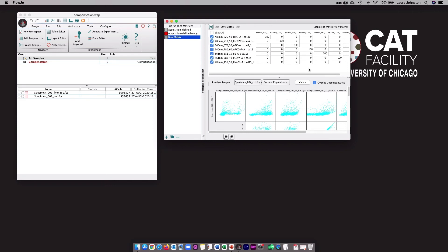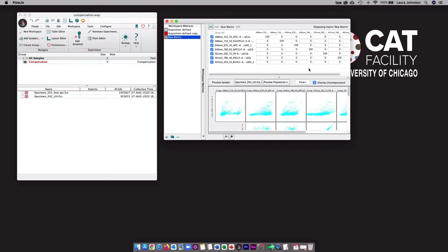The final thing I want to talk about is saving and exporting. Whatever was modified in FlowJo itself only exists in the FlowJo workspace. That means that if you open the original FCS files somewhere else, they are still going to have the original acquisition-defined matrix in them. If you want to share or move the new compensation, you have three options. You can export new FCS files with the new FlowJo compensation matrix packaged inside, or you can export just the matrix itself, or you can save the entire FlowJo workspace to include your files and compensation matrices.